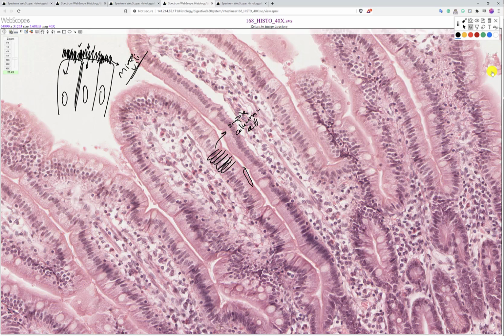So this is the microvilli in all of them. This dark line above the surface of these cells is the microvilli. Now this usually is called the brush border, and there are some enzymes, we'll see that later, produced from there. So these are called the brush border enzymes. Okay, so just to remember the term.